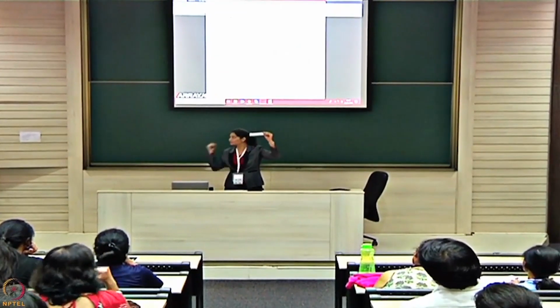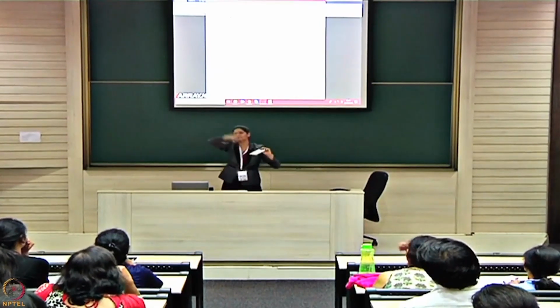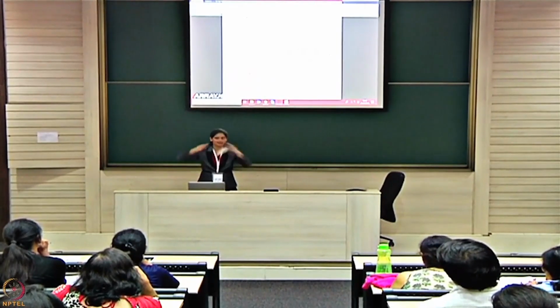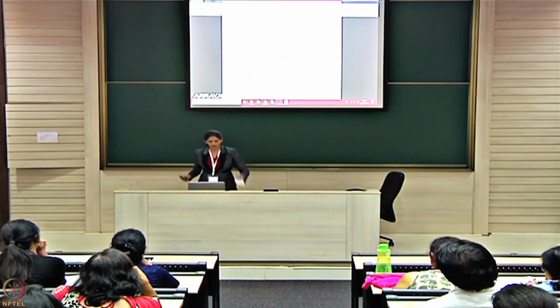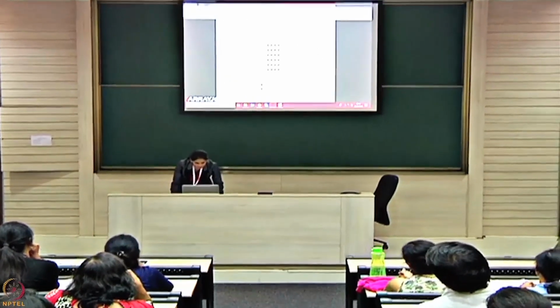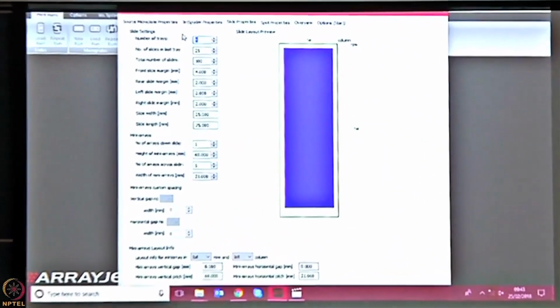Now this feature of the slide shows you where you have to put your sample, so that the array can look how you want it to look, or an ELISA can look how you want it to look. This is only for the reasons of where to put your sample. Once you know where to put your sample, you move to the next stages. This is a fun part. This I really enjoy doing because it's fun.